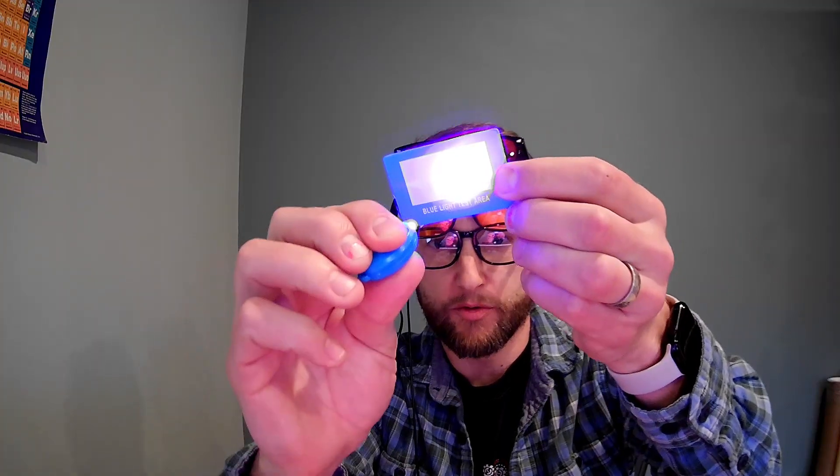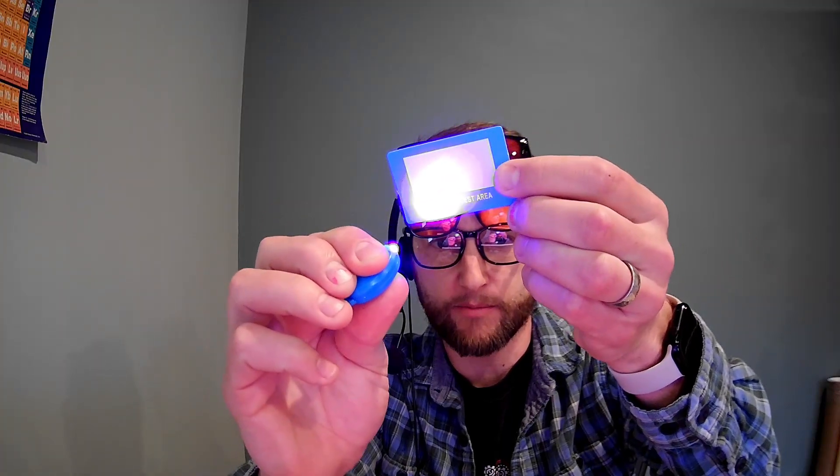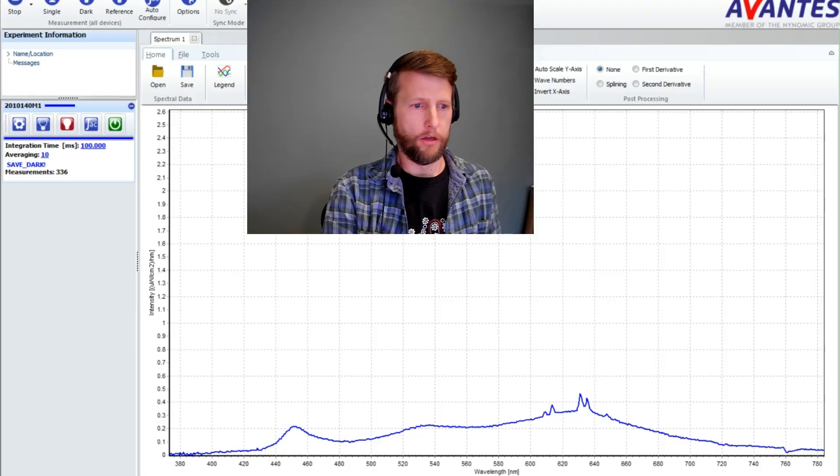I'm going to take a scientific approach today using my spectrometer to actually look at how much light, how much blue light in particular, is getting through these different kinds of blue light blocking glasses. And I'm also going to tell you why these little test cards here with the little blue light that comes with them in the package are pretty much absolute garbage and you can't trust them.